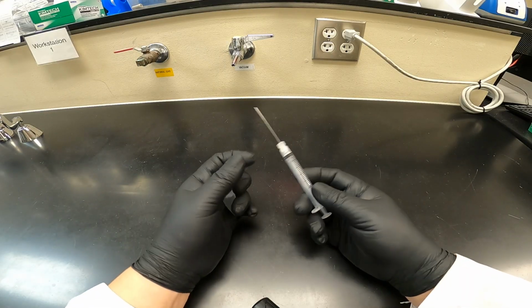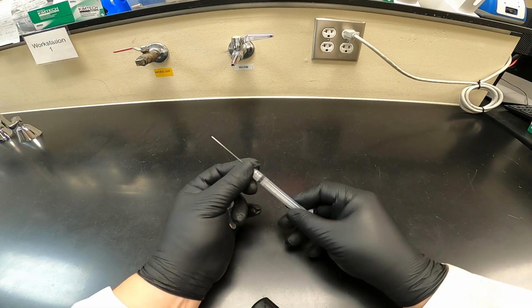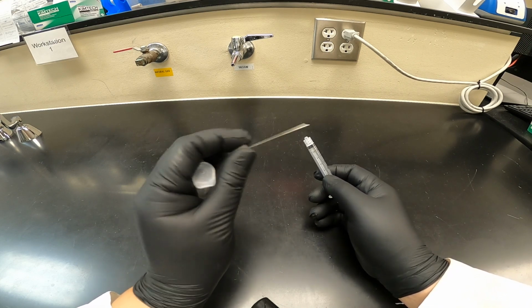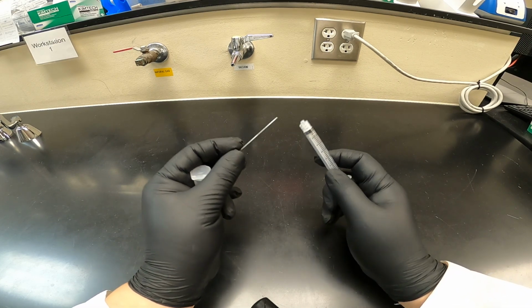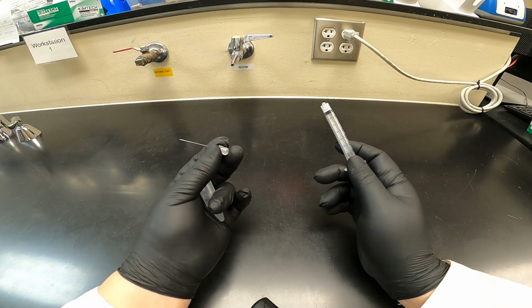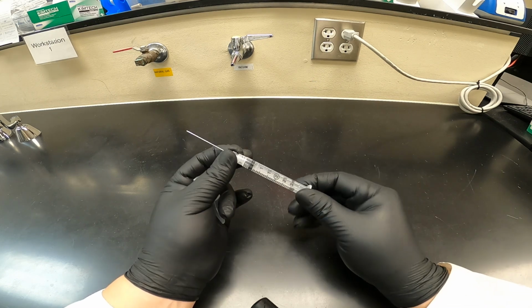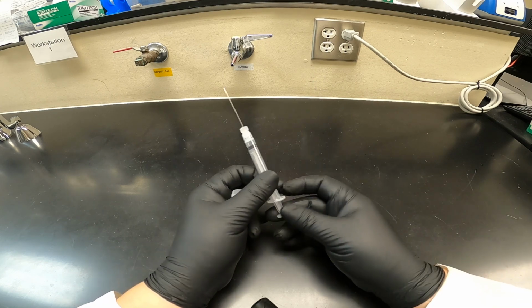Here I've got my syringe that I'm going to use to inject our sample into the system. The needle comes off. Do not throw these away. Please keep these. These are not regular needles. They are blunt-ended needles specific to our instrument. But you will grab a new syringe every time for your sample. So we're going to put that onto our syringe.